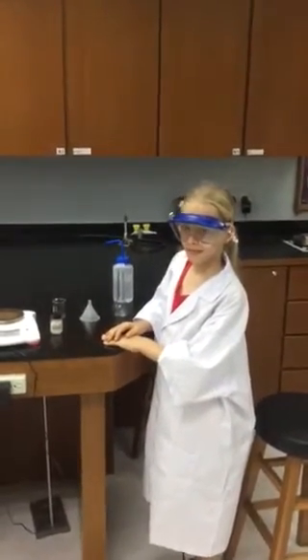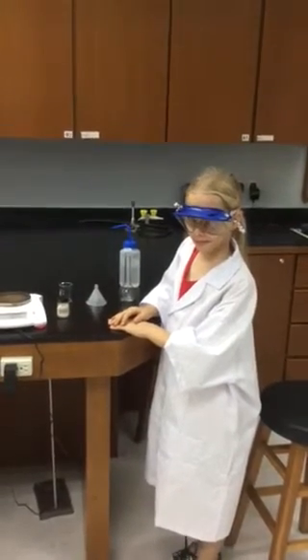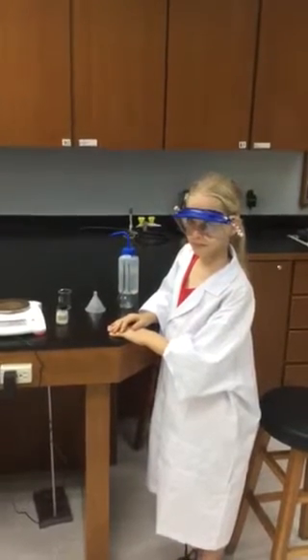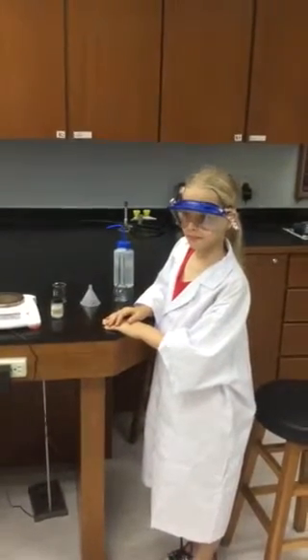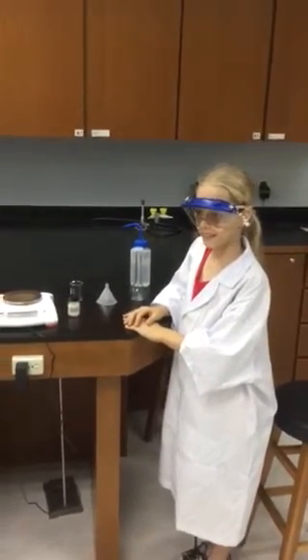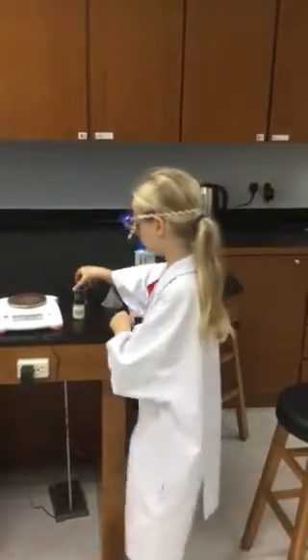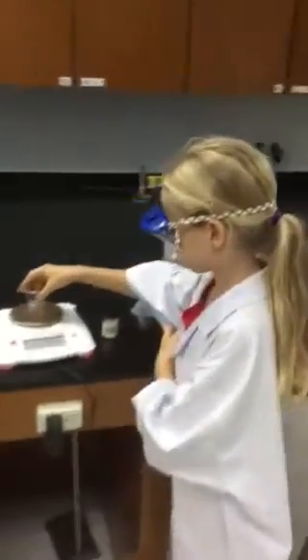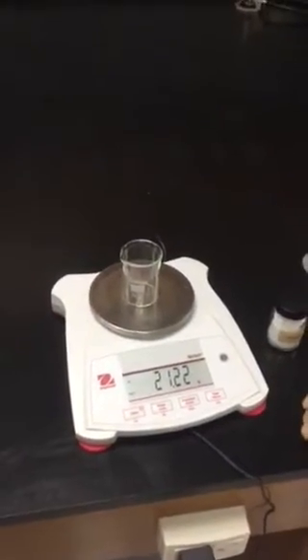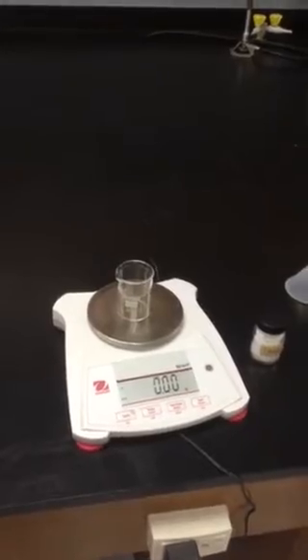Today we're going to make a solution of sodium chloride, a solution with a known concentration. Nina is going to demonstrate for us. Okay, so first of all, we need to take our 50 milliliter beaker and put it on the balance. Now we need to tare that so it goes to 0.